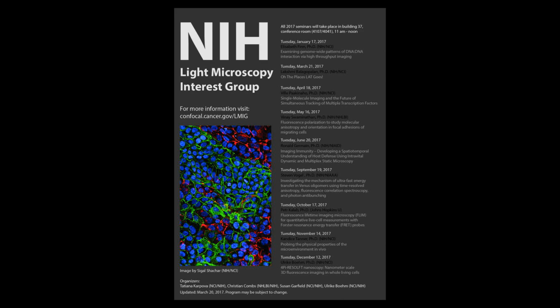Before the pulse reaches the sample, some of the light is reflected by a dichroic mirror and gets detected by a photodiode that activates a delay generator controlling a gated optical intensifier, GOI, that sits in front of the CCD detector. The GOI only allows for detection for the fraction of time when it is open after the delay. Thus, with an adjustable delay generator, one is able to collect fluorescence emission after multiple delay times encompassing the time range of the fluorescence decay of the sample.